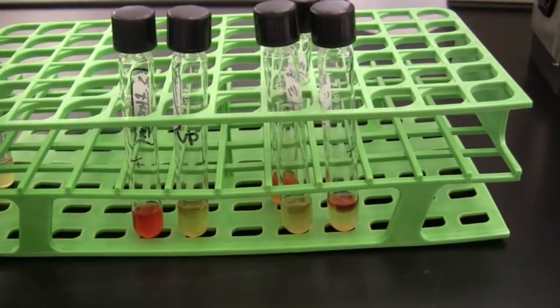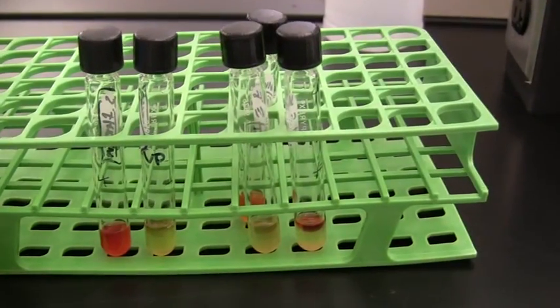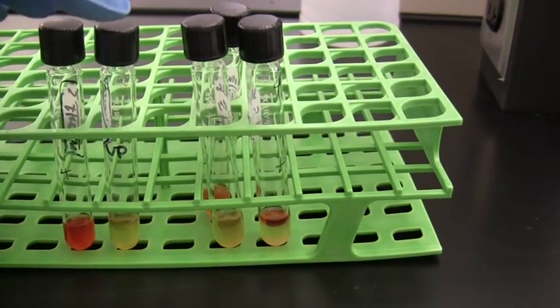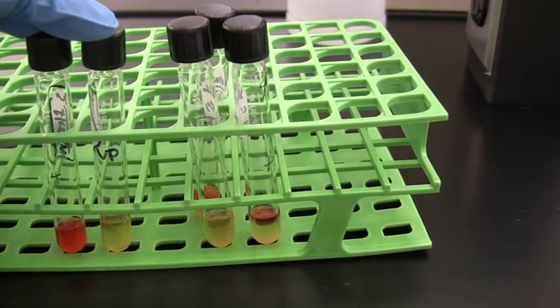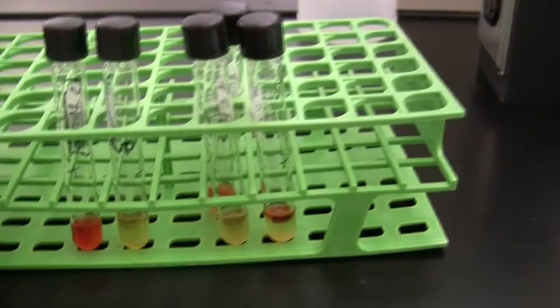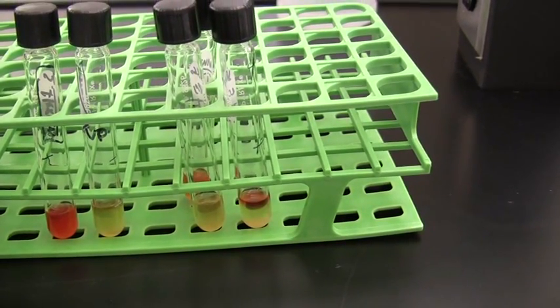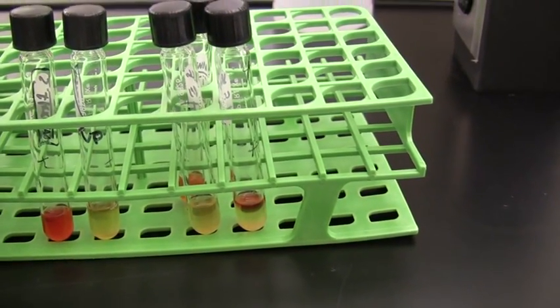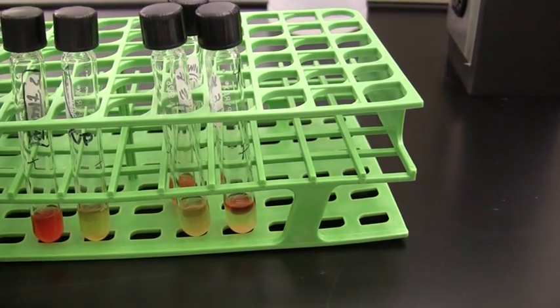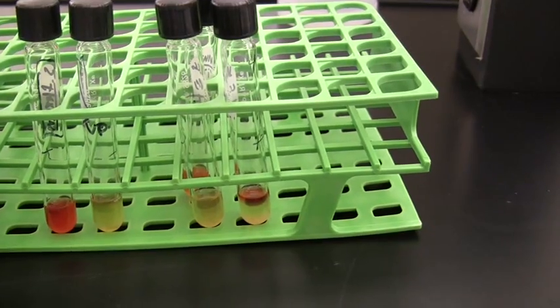This video provides an overview of the methyl red Voges-Proskauer test. This test starts with a basic tryptic soy broth with glucose present, and we're looking to see what type of end products are produced, whether they are an acid end product due to mixed acid production, or whether it's a neutral to maybe even slightly basic end product. We're basically looking for a pH change through various reagents.